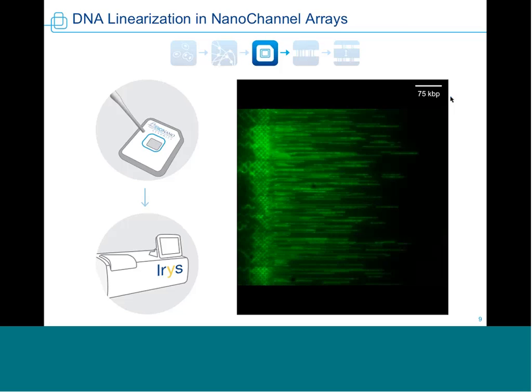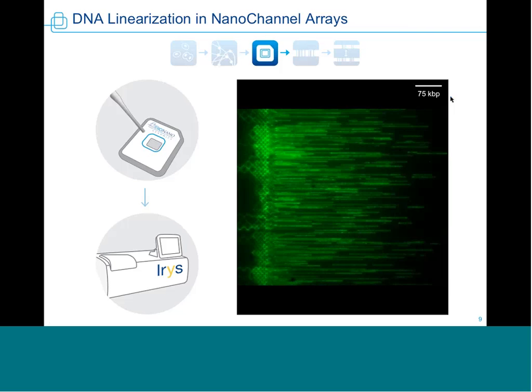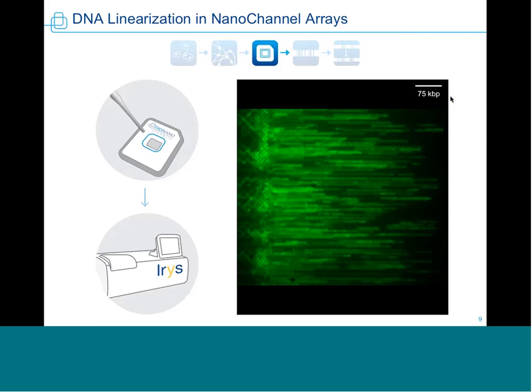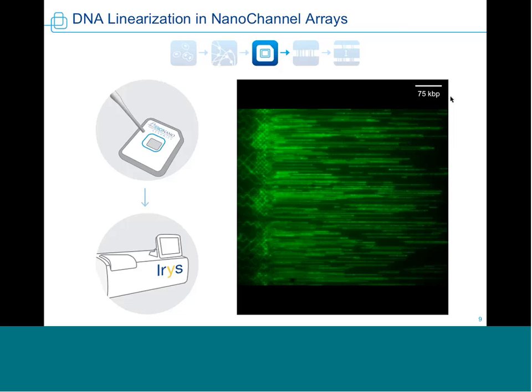Like you said, I'm first going to just take you through some of the motivation of why we decided to do a new long-read NA12878 diploid assembly and how we use BioNano and PacBio data, and then the motivation of what we see your technology being utilized for in a clinical domain, and then I'll pass it off to Ali.